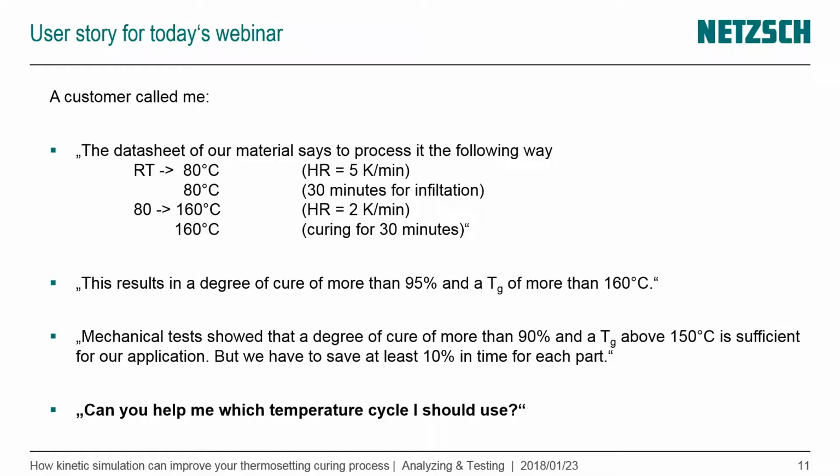And his question was, can you help me? Can you show me what we should do during manufacturing? And I said, yes, we will do that. So I said, send me 200 milligrams of your sample, and we will do that for you.